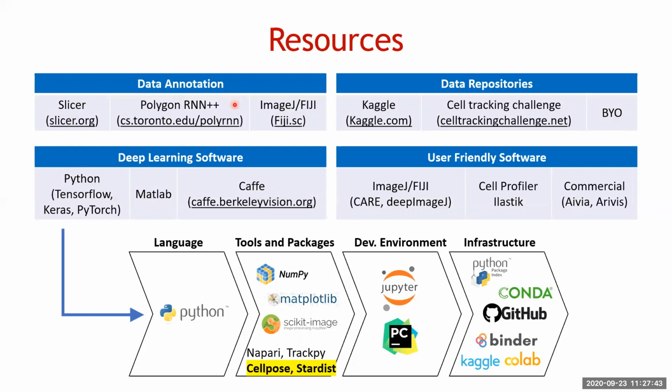It's also a great example of transfer learning, because it was shown that at least one of their models was built on traffic data to recognize street signs, traffic lights and cars on the road. But it was used very successfully to label cells. So that's a good example of transfer learning.